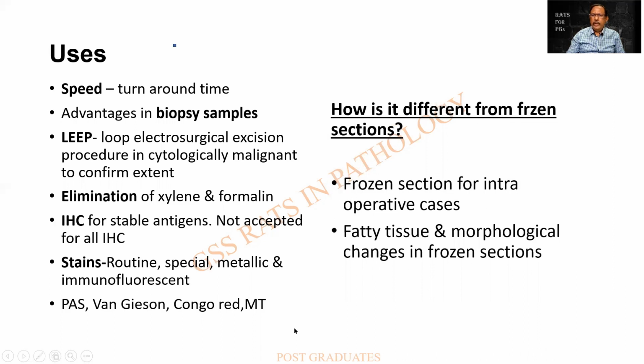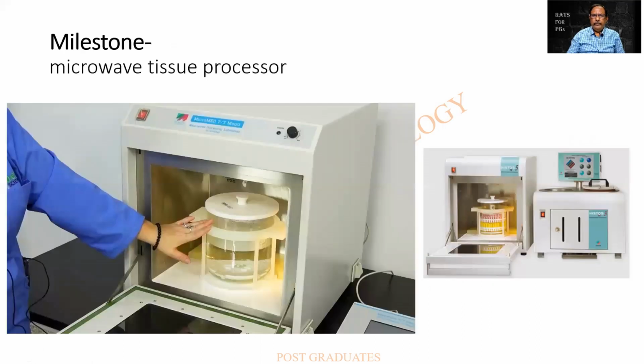It is not equivalent to frozen sections. Frozen section is when the patient is on the table, and it is to preserve fatty tissue, and some morphological changes can be lost in frozen sections. Both are not the same.